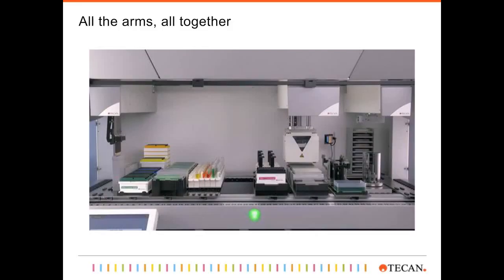The robotic gripper arm, just to say it out loud, doesn't have to use the finger exchange option. That is, we also have the ability to deal with fixed fingers that are permanently mounted to the head. So if you only need to use one of those types of fingers, we would just screw that on, and that's all you would have.